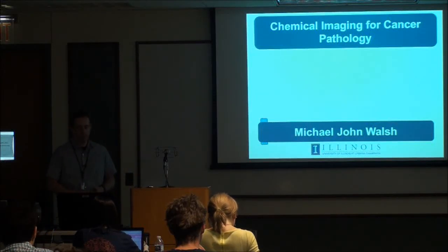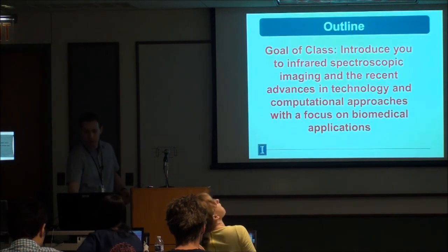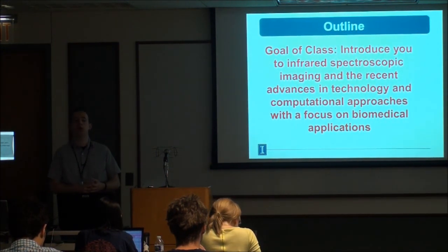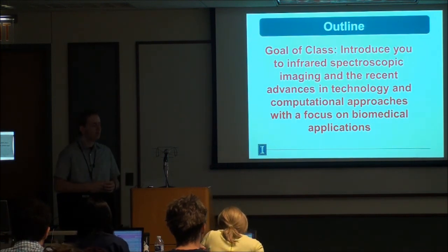Okay, so today we're going to start off talking about chemical imaging for cancer pathology. The goal of this is going to be to introduce you to mid-infrared spectroscopic imaging, or FTIR, often called infrared spectroscopic imaging, even if they're referring to mid-infrared.